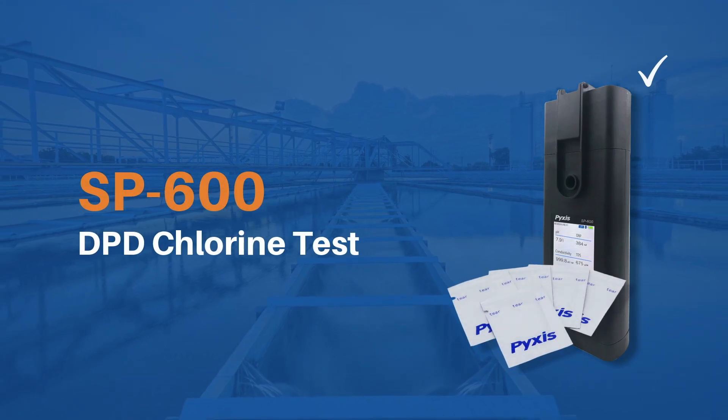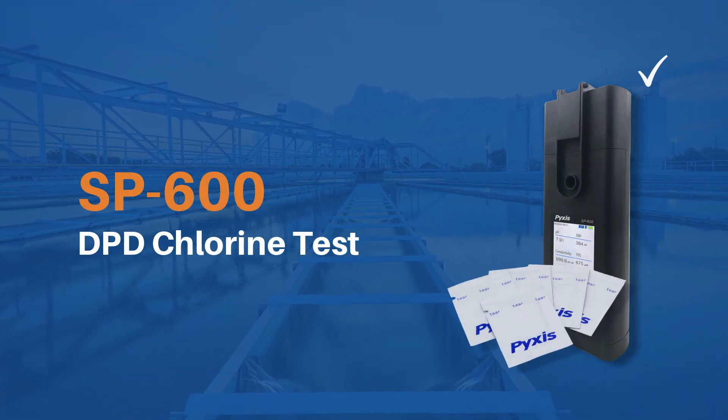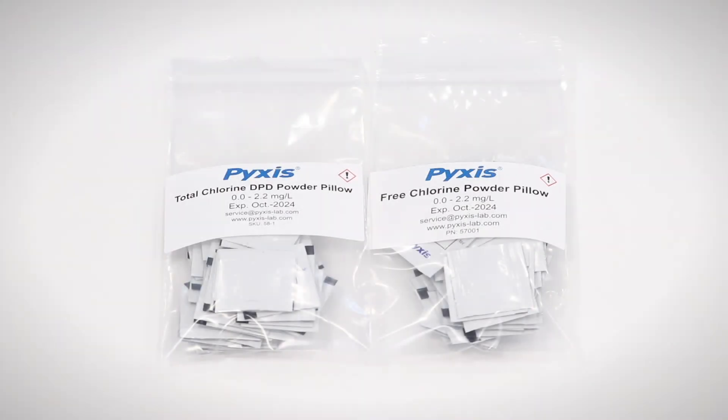This video demonstrates how to conduct the DPD chlorine test using the SP600 handheld water multimeter. For this procedure you will need to use 10 milliliter DPD free or total chlorine powder pillows available from Pixis lab or other industry providers.